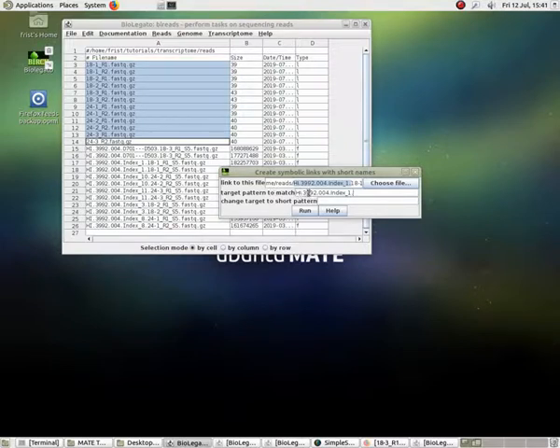So if we shorten the name of the symbolic link by getting rid of the beginning part of these file names, we can create a very orderly and understandable set of symbolic links that can be used as aliases for the files with the actual long names. So here we see there are 2 time points, 18 hours and 24 hours, 3 replicates, and then the R1 and R2 files are the left and right reads.